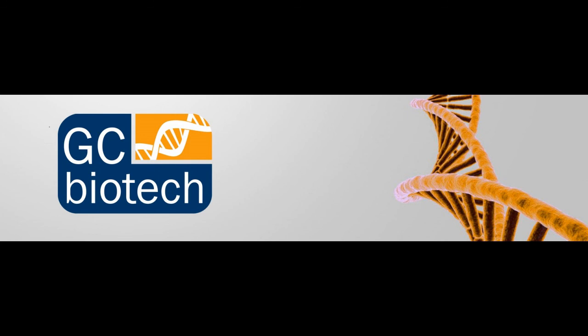Oh, okay, thanks. So basically we can, the contamination detection that we put in place on the DS11 is really based around things like purity ratios, and spectral analysis is confined to checking for things like negative spectra.